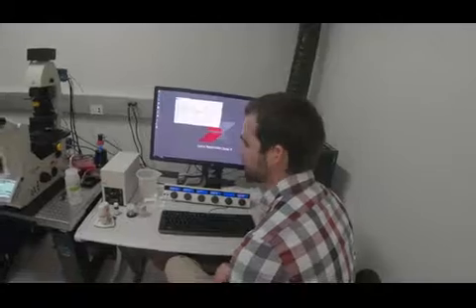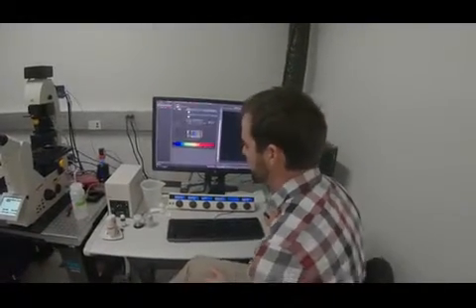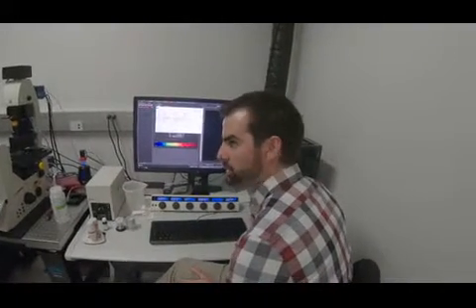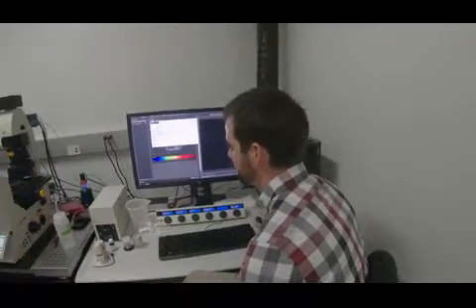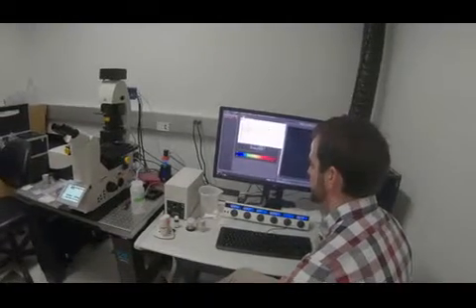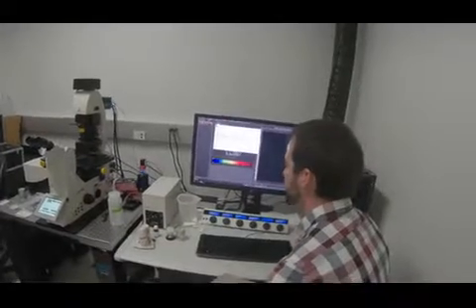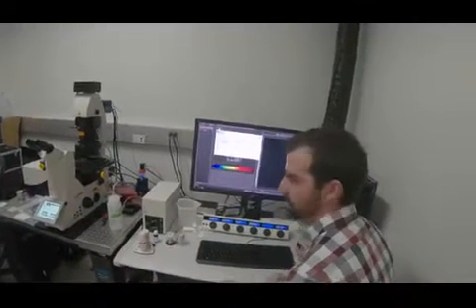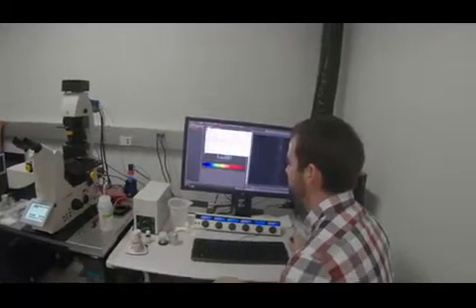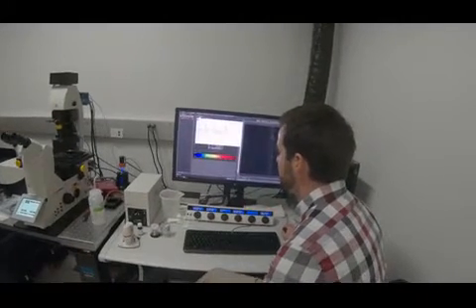So they're ridiculously fast, and everything that you have open in the LASX software is temporarily written to this hard drive, which gives you two things. Once it's opened in LASX, you can navigate through large data sets a lot faster because it's on a really fast drive. It's not in RAM, it's in a hard drive. And by being written to a hard drive, even if it's not saved yet, if you lose power because of a storm, which never happens in Florida, then everything is still safe.